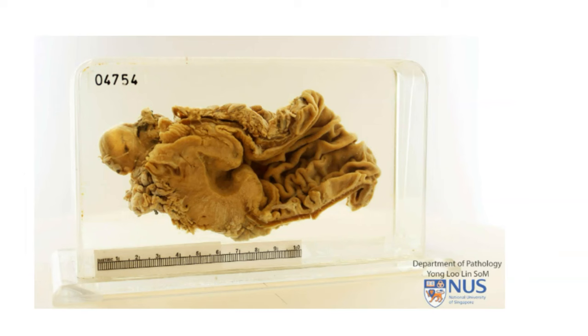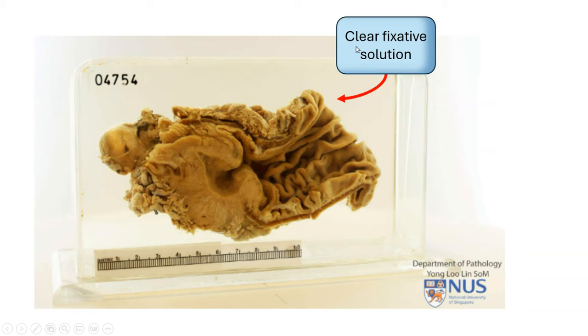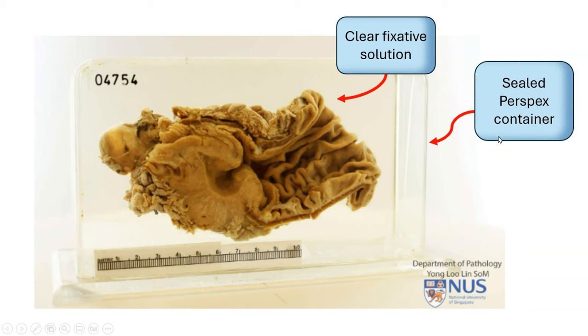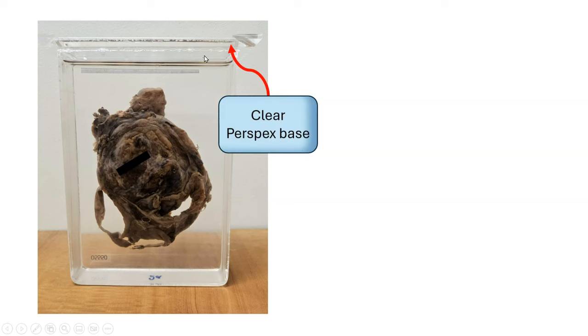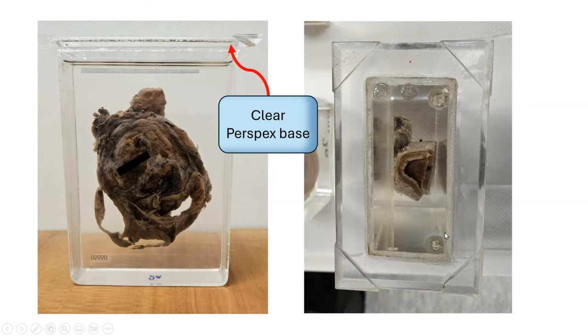Here is the anatomy of a pathology pot. We have the specimen, which is surrounded by clear fixative solution, and this is encased in a sealed, transparent perspex container. Here is an example of a pot that is upside down, and this is the base. Here is a bottom view looking downwards at the base. You may notice these interesting looking areas here, which I will explain later.